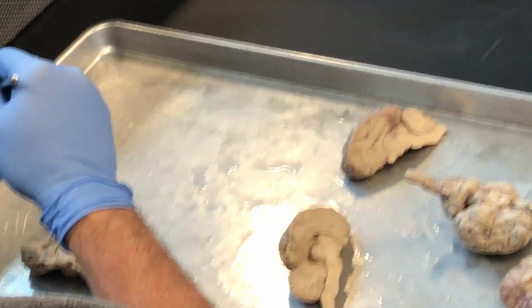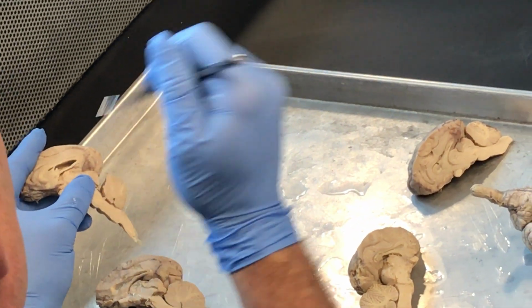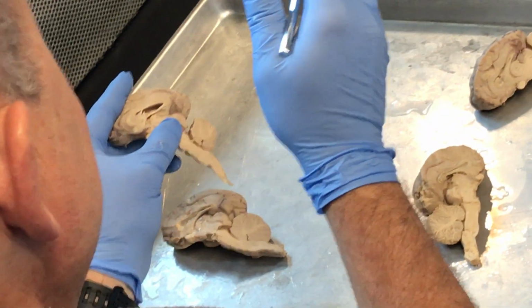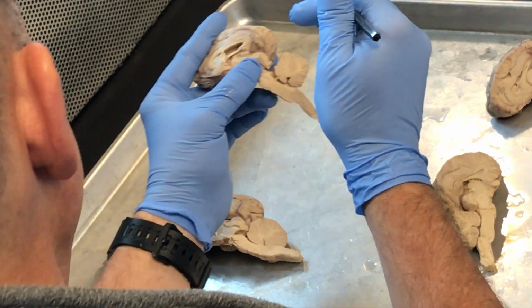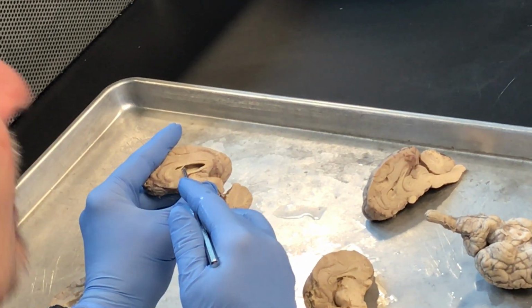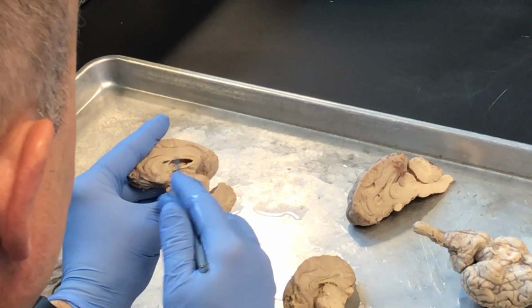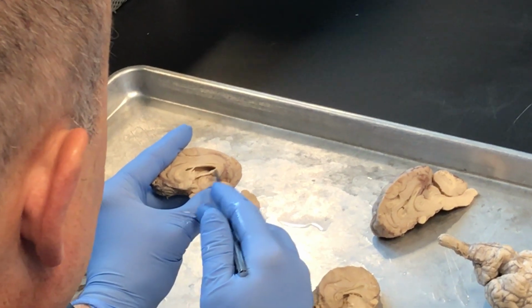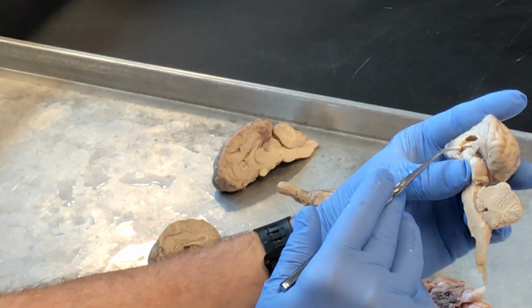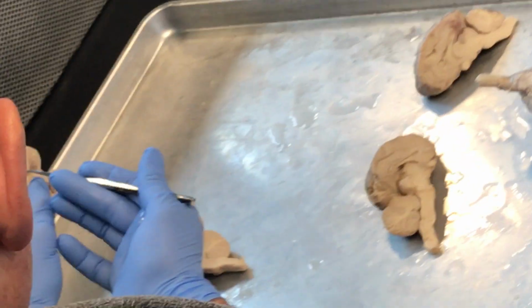One inside of each of these cerebral hemispheres. Lateral ventricle on the right, lateral ventricle on the left, 1, 2. Which one's 1, which one's 2, it doesn't matter. There's two of them. So when we look at that, I like to say that looks like the mouth. Do you see the upper lip right there? Do you see the lower lip? The upper lip is the corpus callosum. The lower lip is what we call the fornix.